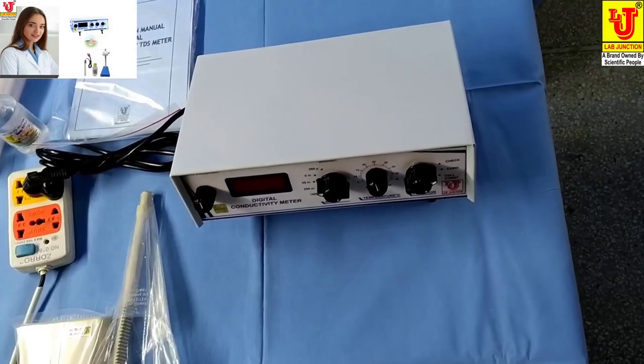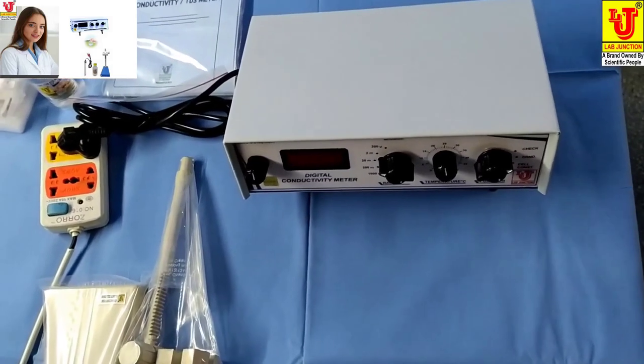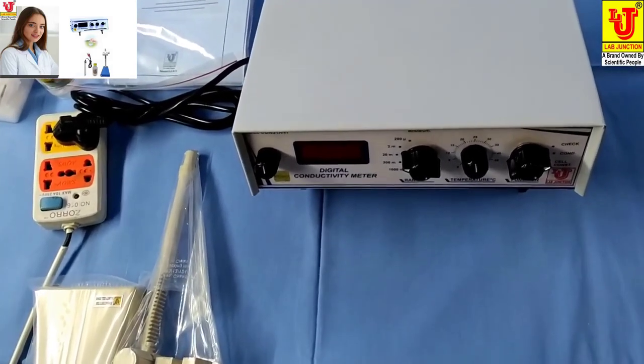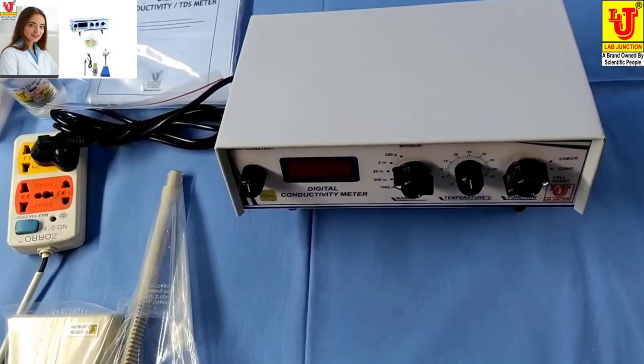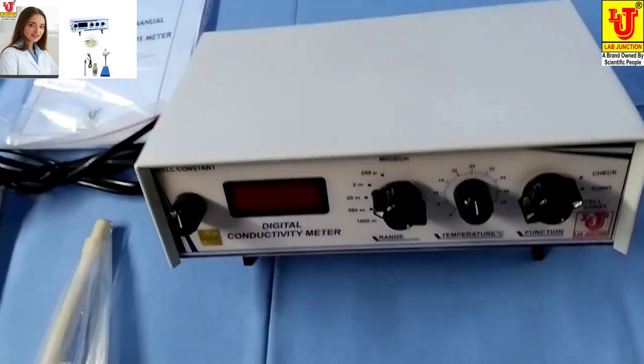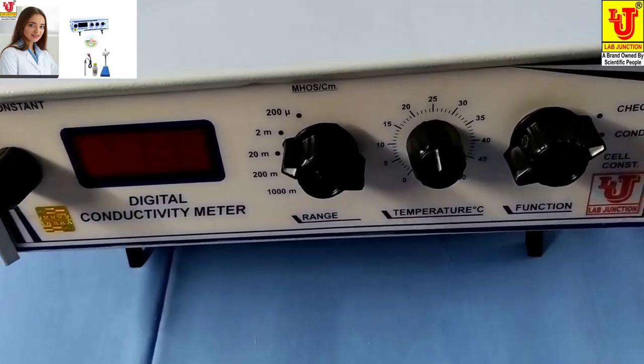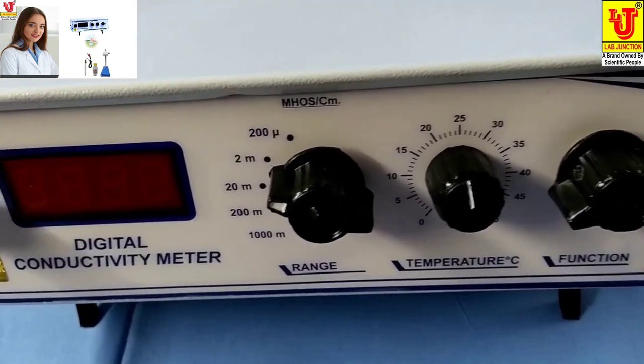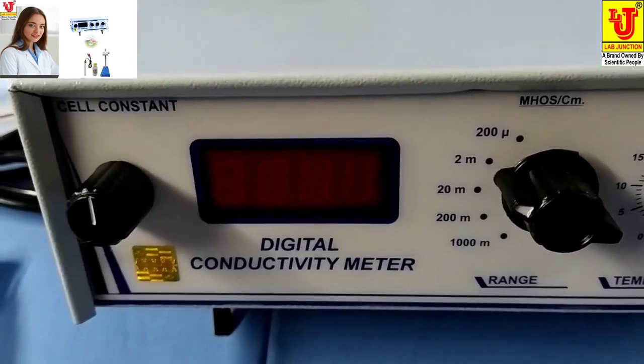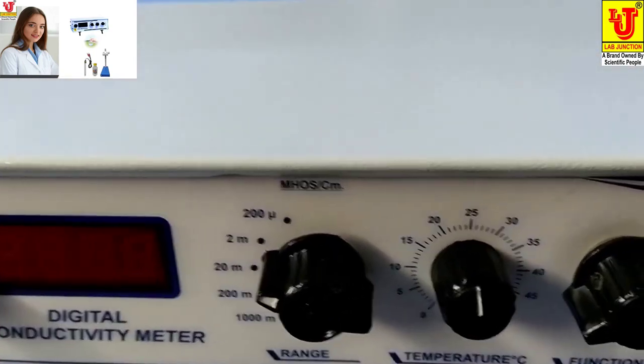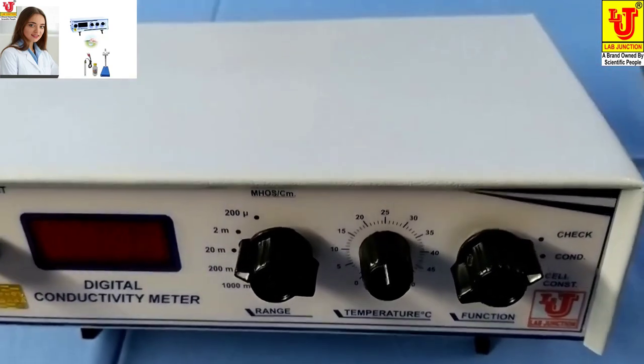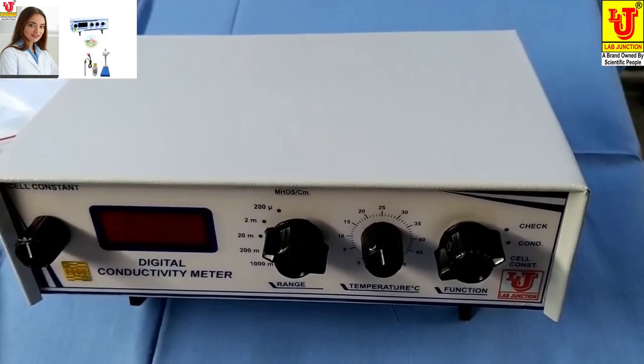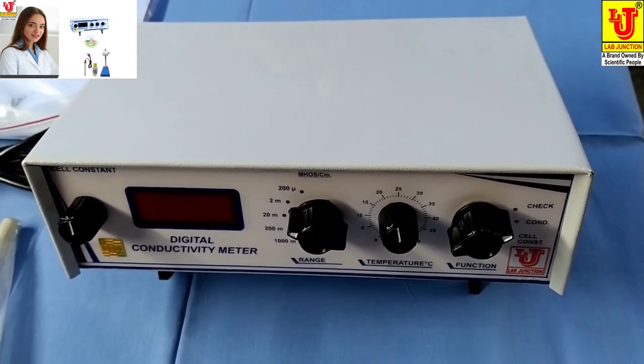Lab Junctions Digital Conductivity Meter. We have two models of Digital Conductivity Meter. One model is Lj611, second model is LjA06.